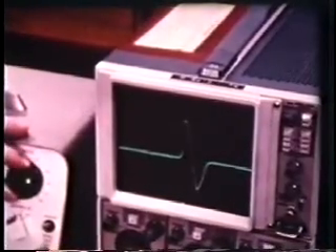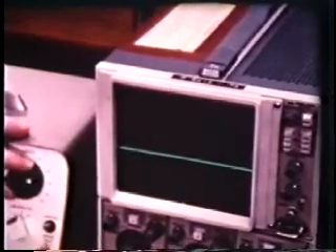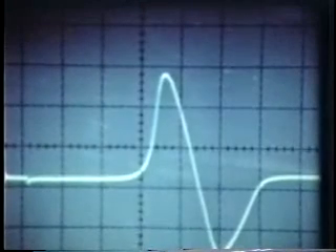This is the action potential, here continuously displayed because the frequency of stimulation is high.